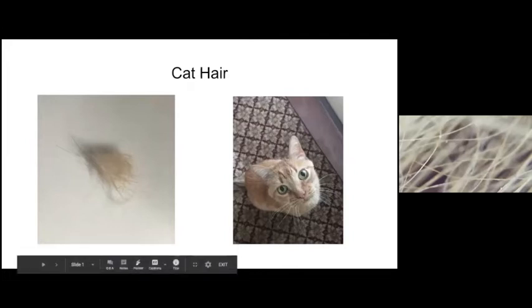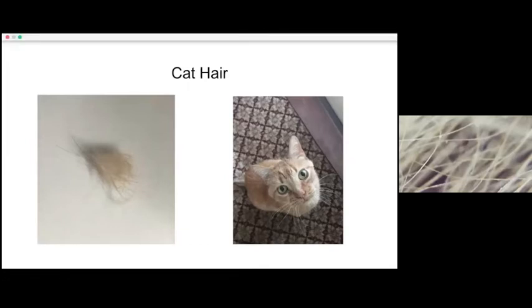Ani, do you have a question? Is it because they would keep warm? Yes, that's exactly right. That's what I was thinking, at least. The hair does provide it with a coat to keep it warm. So it can go out in winter, kind of like the mountain lion, right? Great. Do you guys want to see something else under the microscope?